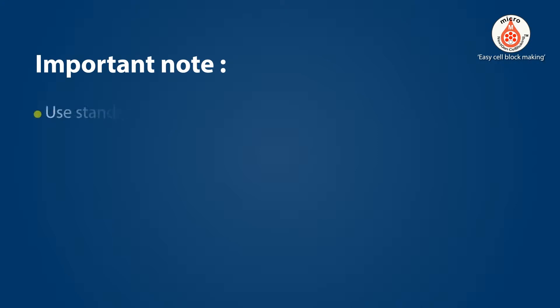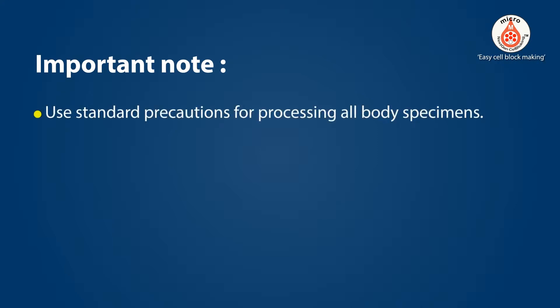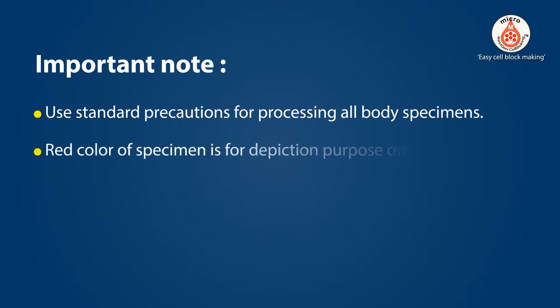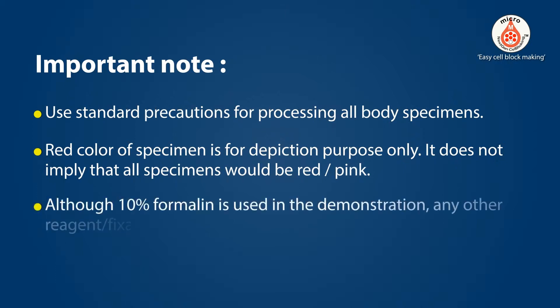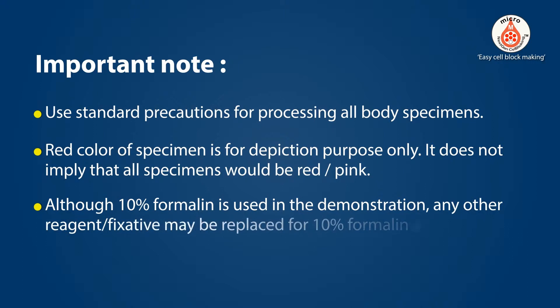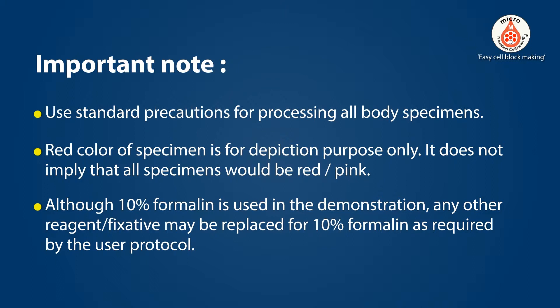Important note: use standard precautions for processing all body specimens. The red color of the specimen is for depiction purposes only and does not imply that all specimens would be red or pink. Although 10% formalin is used in the demonstration, any other reagent or fixative may be substituted as required by the user protocol.